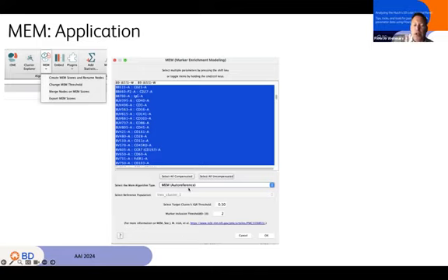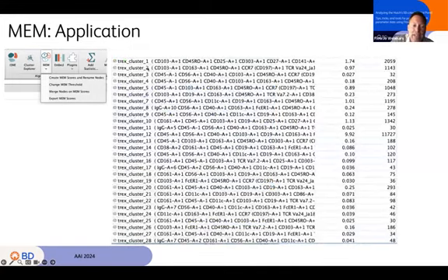You will then select what type of MEM reference you're going to use. So auto references use all the other clusters, specific populations in there. There's also a referenceless MEM. So if you're like, I don't know, just use the full range of the data. If it's at the left end of my data range, give it a low MEM score. If it's the high end, give it a high MEM score. Cool, you could do that as well. And there's a little threshold you can pick for, tell me what level of MEM score is interesting I'd like to see. Say okay, and all of my T-Rex clusters then get appended with a MEM score.